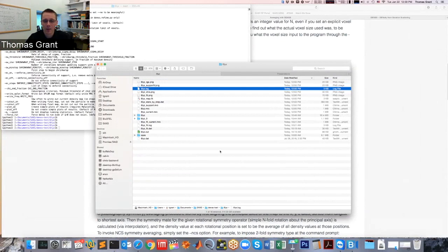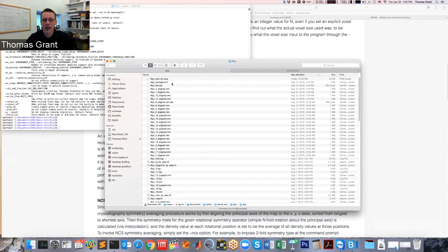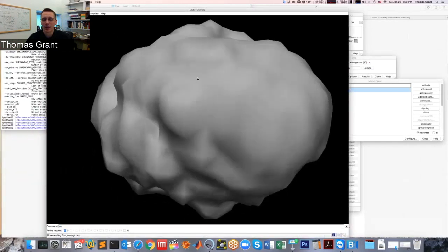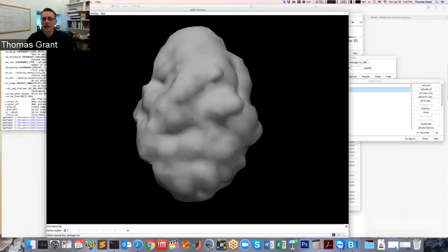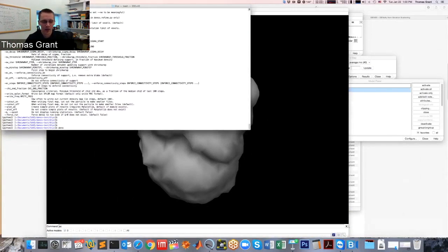So that's that. One thing to note is that if you were to do the full averaging procedure, this final average map is unlikely to have a scattering profile that actually matches your data because it's an average of a bunch of different reconstructions. And so there's now an option in DENSS, one of these scripts, denss.refine.py.